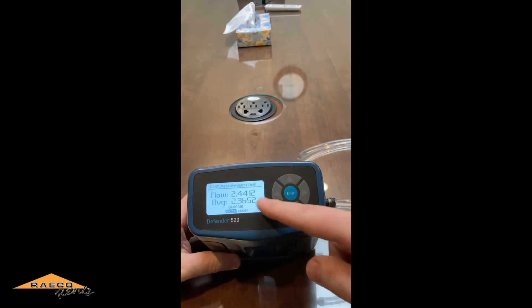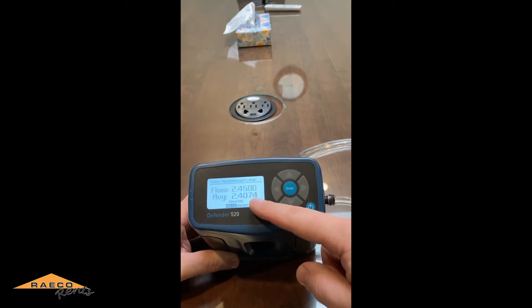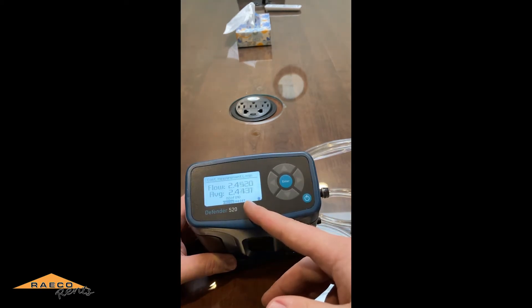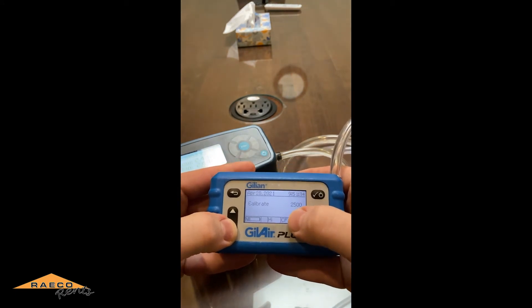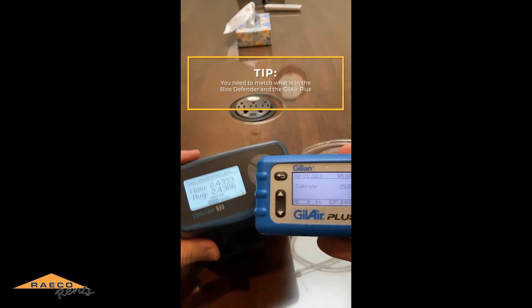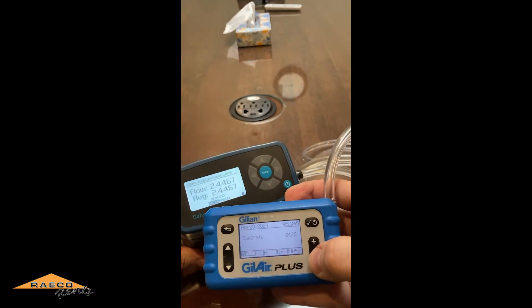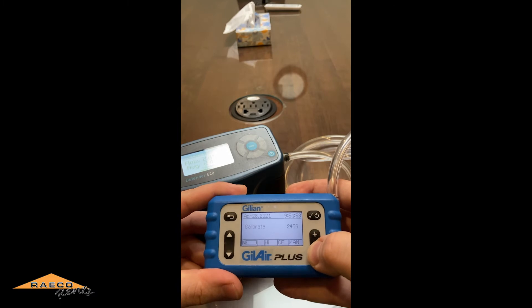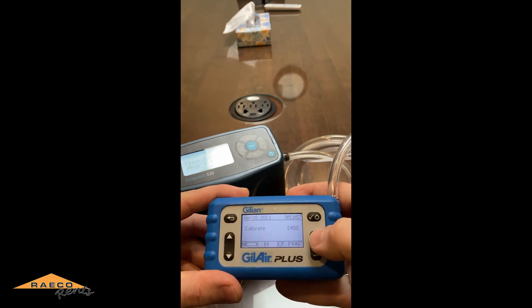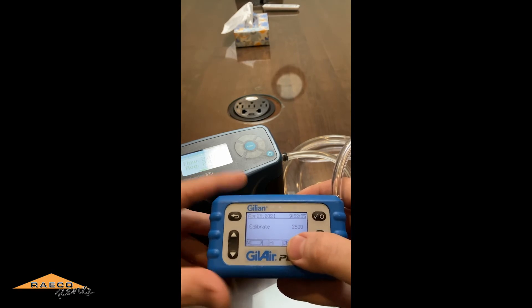The BIOS Defender will keep reading and gives you the real flow rate along with an average of your measurements. Right now we're trying to calibrate to 2500, which is 2.5 liters per minute. After 10 readings it averaged about 2.43–2.44. Using the plus and minus buttons on the pump, we'll adjust the flow down to match what the calibrator is showing — so we'll go with 2.45, which is 2,450 cc's per minute. We'll hit the check button and the pump will make an adjustment, going back to 2500.